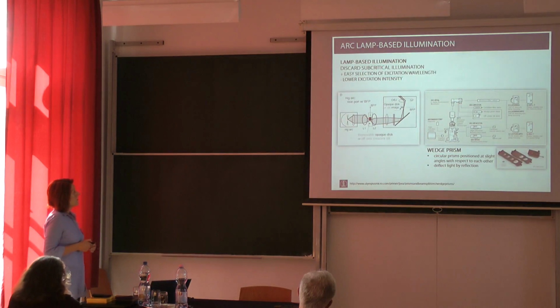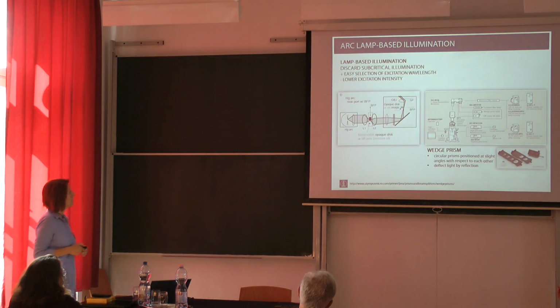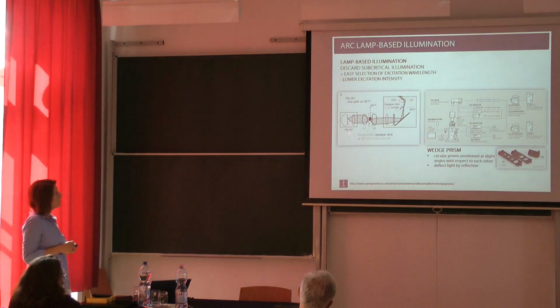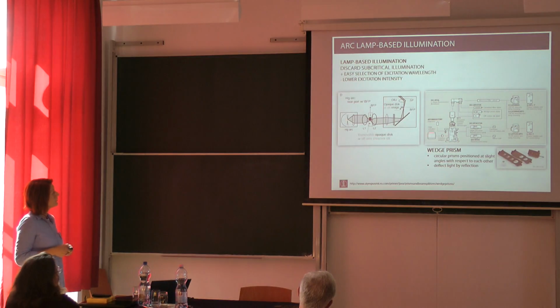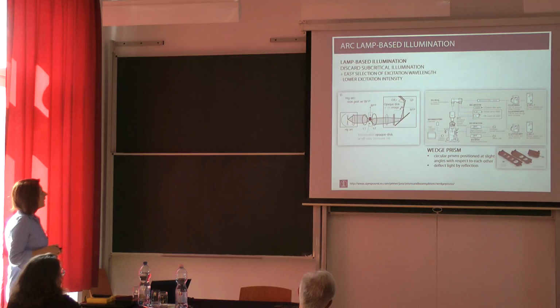Okay, so TIRF can be done with a lamp, not only with lasers. These two figures schematically show the configuration for lamp-based TIRF illumination.